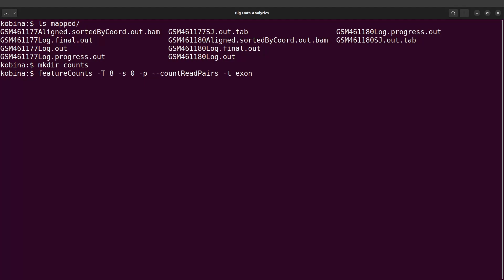I think exon is even the default. With the identifier, we are going to use gene_id. So we say -g gene_id. We are also going to specify the minimum mapping quality, so we say -Q 10.